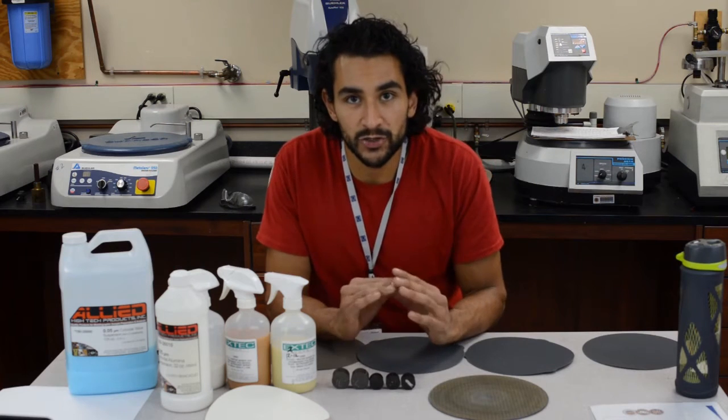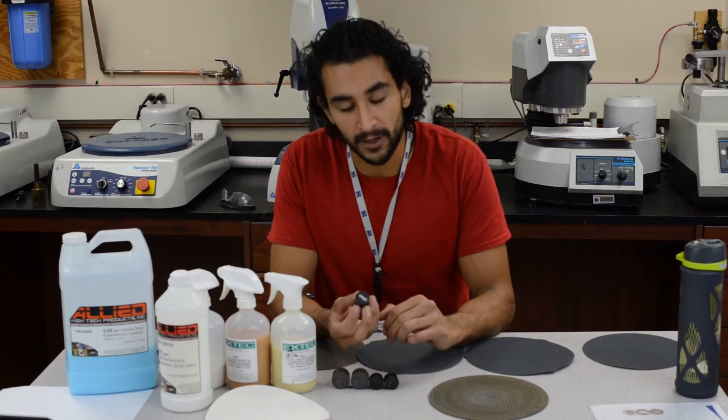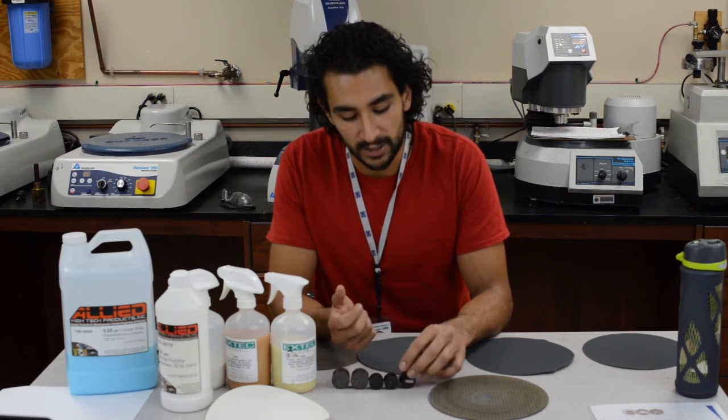They don't last very long. If you don't believe me, you can check this video out. But basically, you want to use them for about one minute and a half. Any longer than that, the pad has significantly lost its ability to remove material and is actually changing in a way that could damage your sample. So be aware of that. Now we're ready to start grinding and polishing on these samples, on the front faces of each one of these pucks to get the right cross-section that we need.